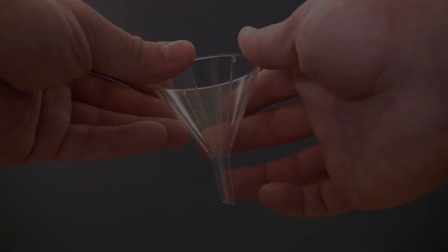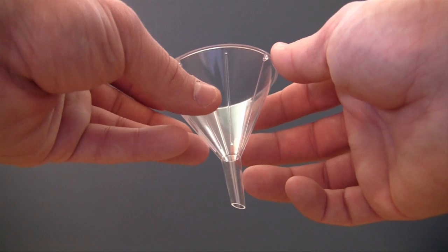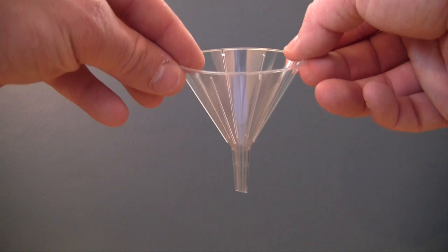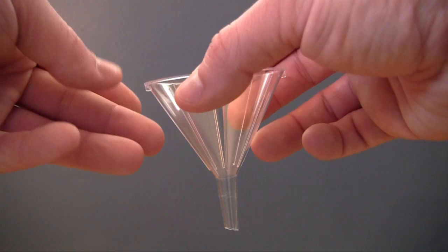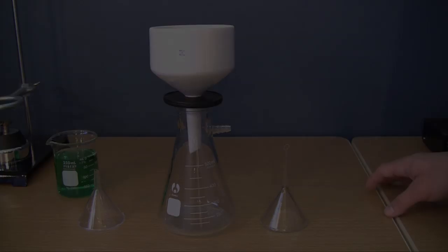Now whenever you see a funnel like this one right here and it has ridges on the side that is what the ridges are for. If this didn't have the ridges then whenever you put it in a container it would make a tight air seal and no air would be allowed to enter the container. So these funnels are really cool, again these like I said are my disposable plastic funnels because you don't even have to hold it. They already have the ridges built in to have a little bit of space between the side of your container and the funnel. Really handy.